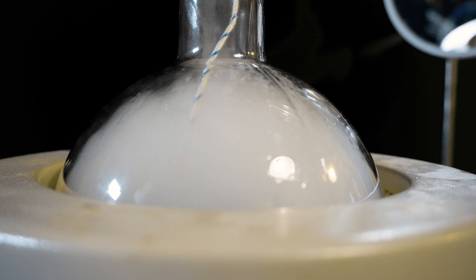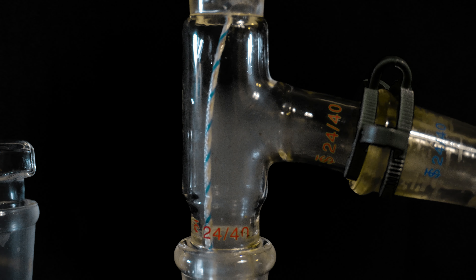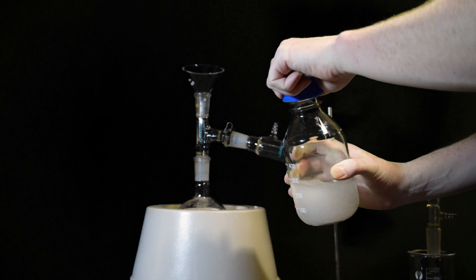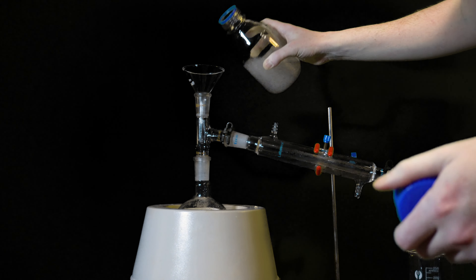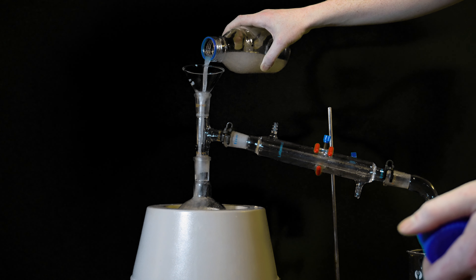This process takes absolutely forever — the distillation took me probably 6 to 8 hours. I treated the crude cyclopentanone with a lot of potassium carbonate, which gets rid of the leftover adipic acid and also starts to dry it out a little bit.